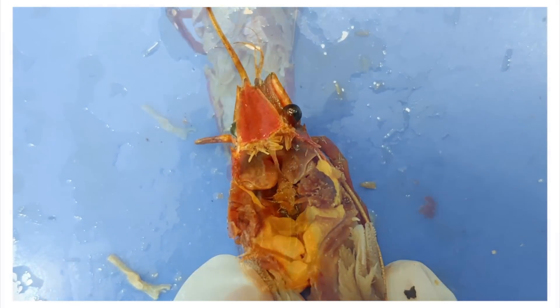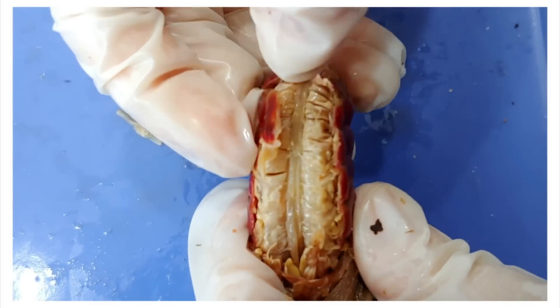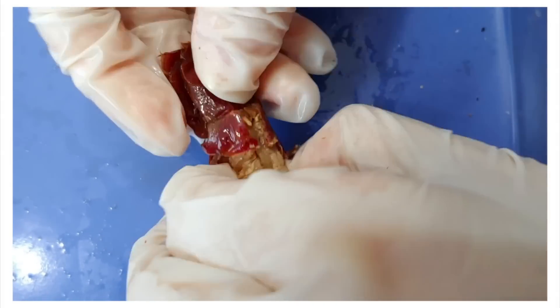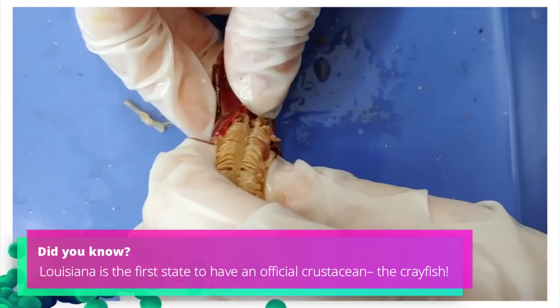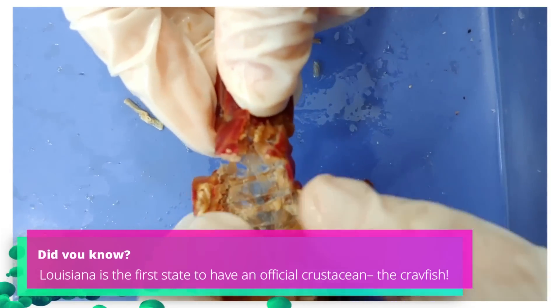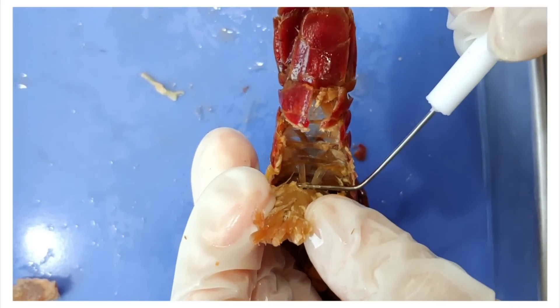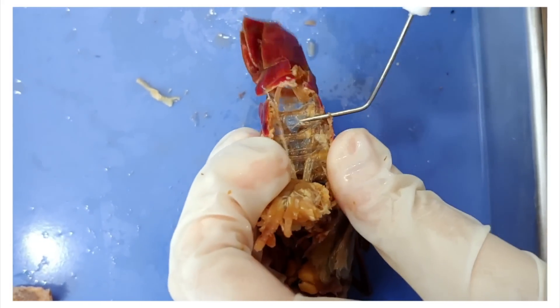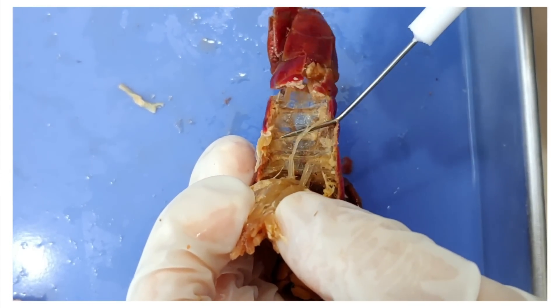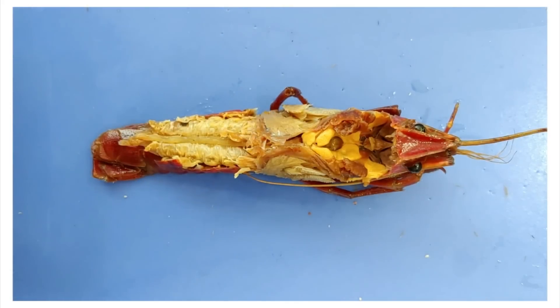Now I'm going to move all the way down to the end of the abdomen and remove the abdominal muscles to get a look at the nerve cord. This is the same nerve cord that we saw before, and it runs down the full length of the body.